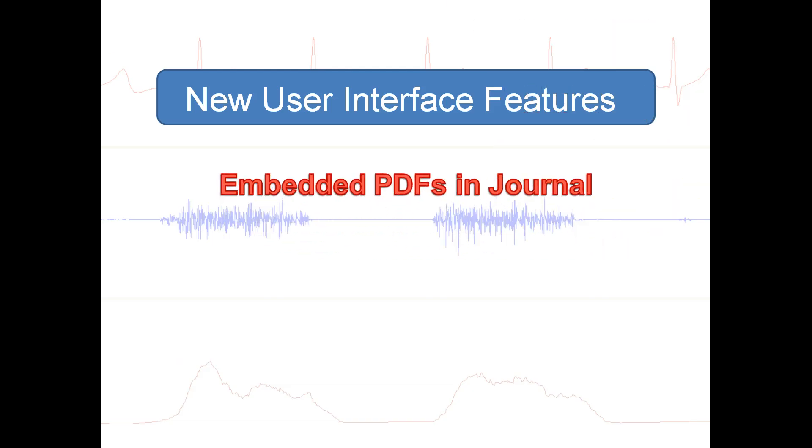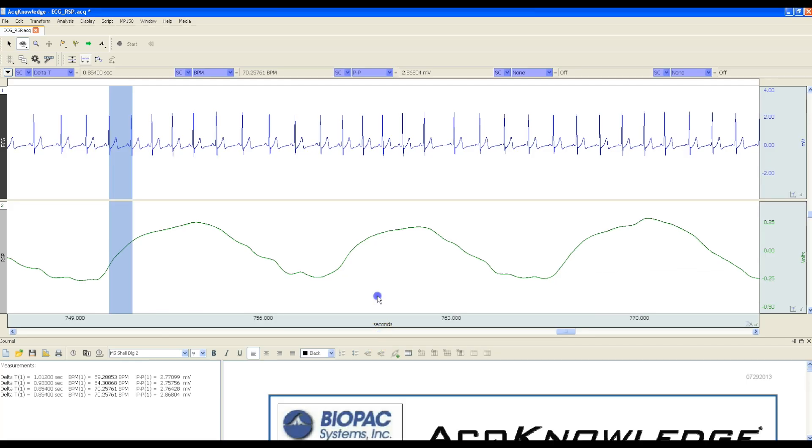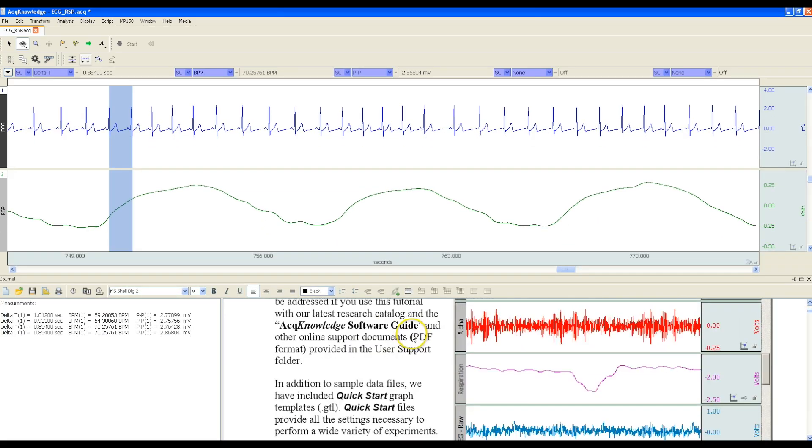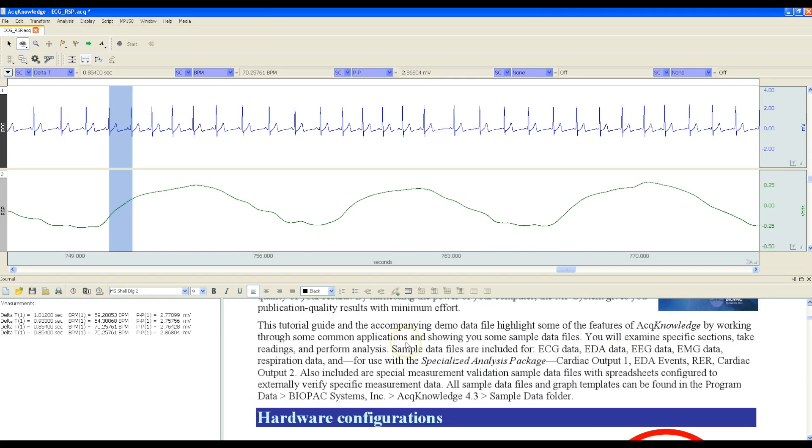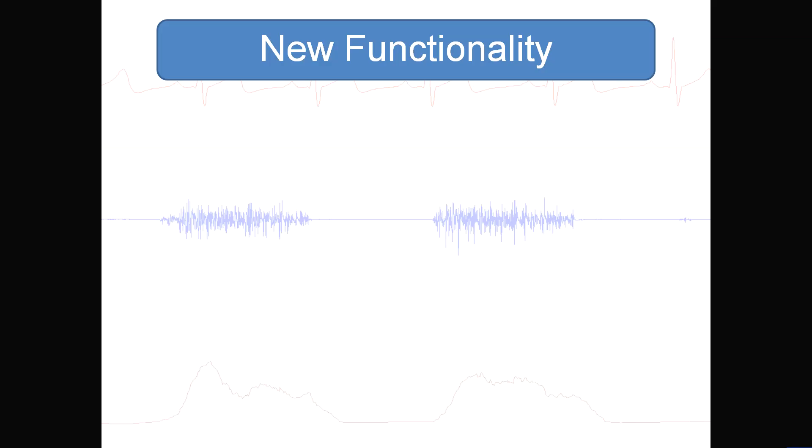Embedded PDFs now allow you to embed manuals or protocols into the journal and split the view to continue taking measurements.